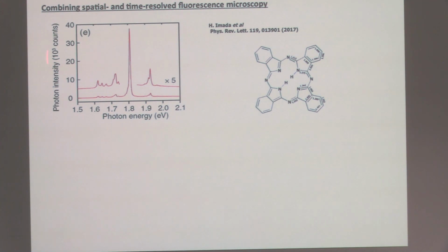So here you have a fluorescence spectrum of this molecule. You can see that there are lots of different features here. You have one very intense peak that is named the QX, a dipole that is along these two hydrogens in the center of the molecule, oriented like that. You have a QY dipole that is perpendicular to this one, which corresponds to this peak here at higher energy. And you also have the vibronic features that we just mentioned, that we won't discuss much now. So we will just concentrate on what happens here.